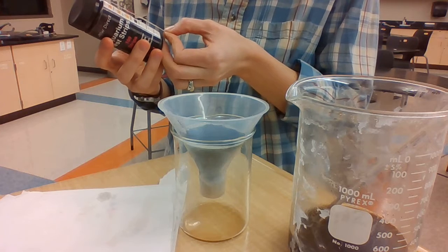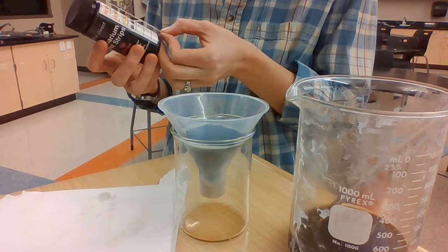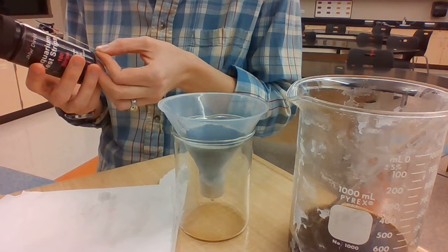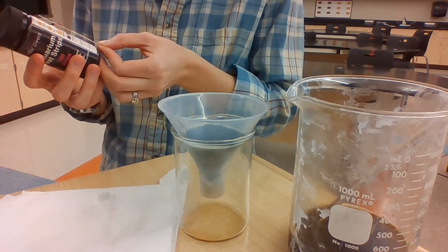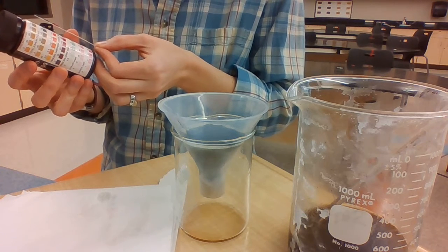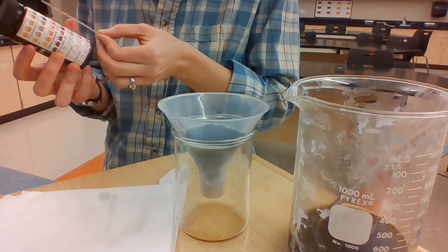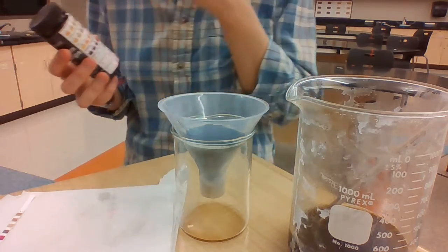Free chlorine is a 3. Hardness, I'm going to say, is at 50. pH is at 9, and alkalinity is at 360. So that's the contaminated water test.